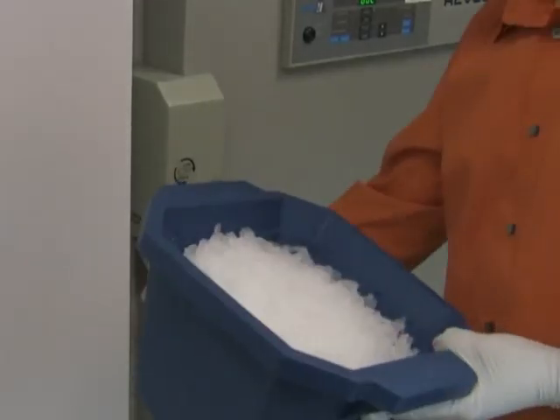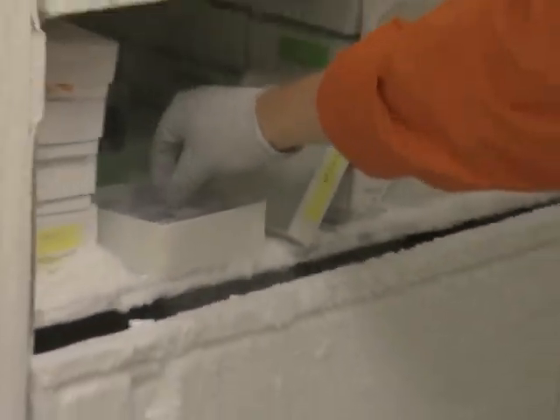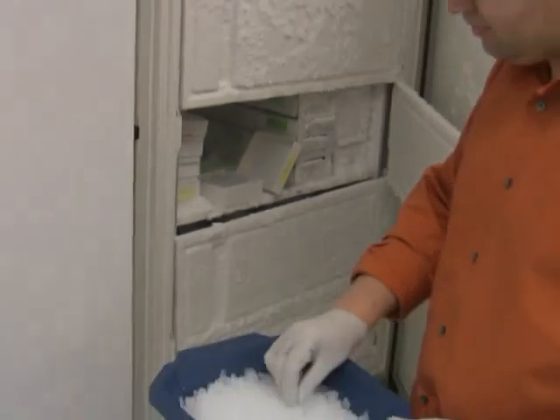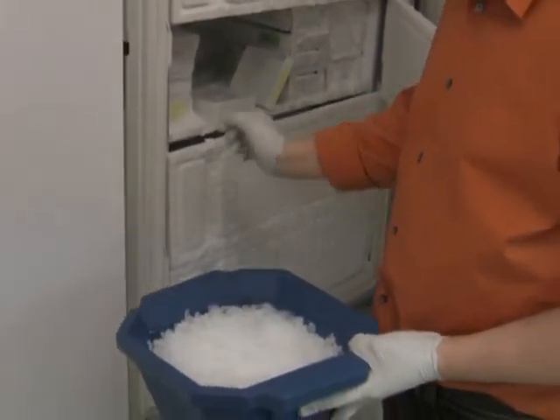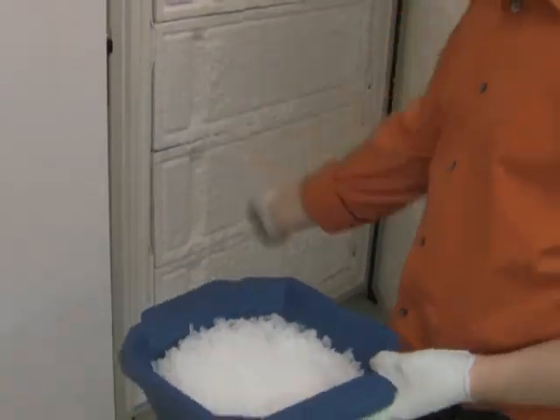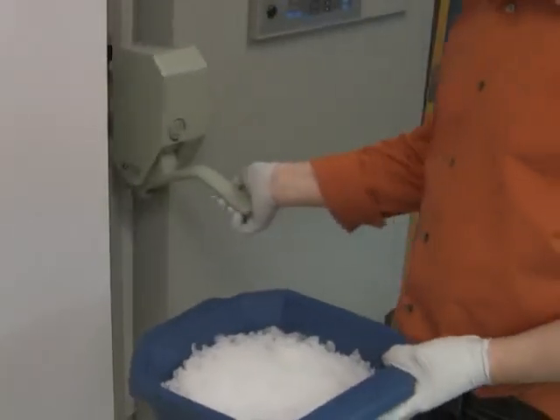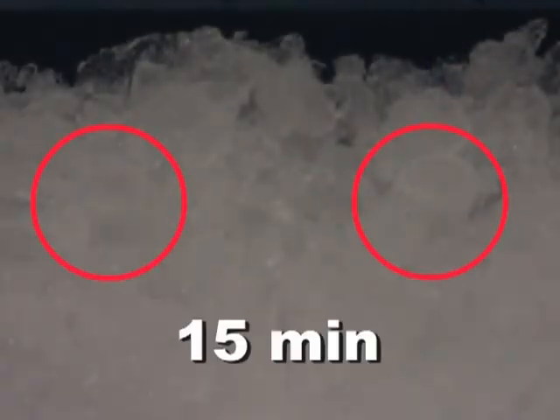I start the transformation by taking the competent cells out of a minus 80 degree freezer and thawing them on ice for 15 minutes. Each of those tubes contains 200 microliters of competent cells prepared for one transformation. Note that competent cells are sensitive to room temperature exposure, so I put them on ice the very moment I remove them from the freezer.